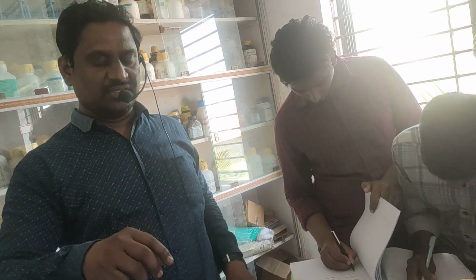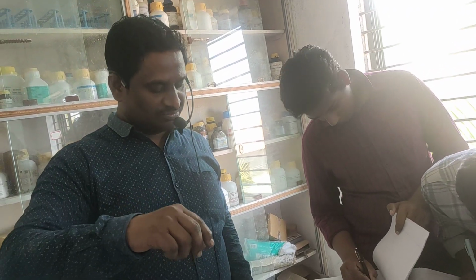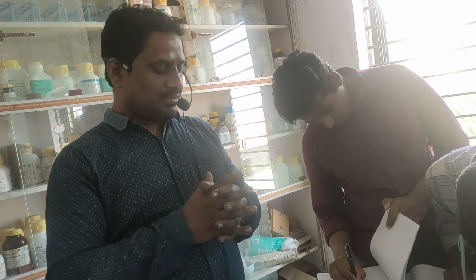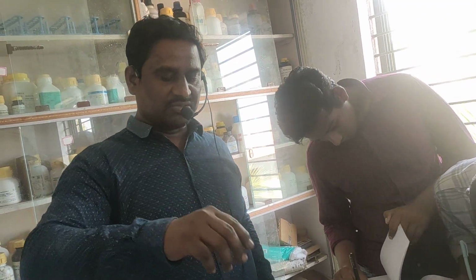Which group is present? The first group is present: the bracket CO3 minus 2. Now we want to detect whether it is CO3 minus 2 or not. So, detection of the first group.